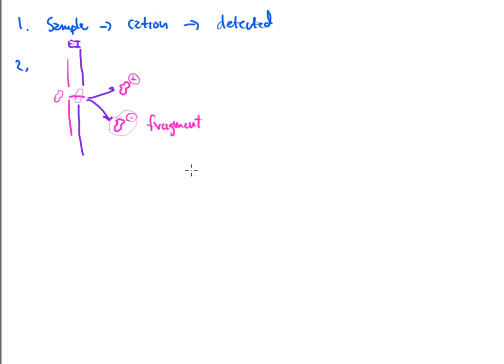And what we typically look for is something called a fragmentation pattern. They all will break up in a very specific way. They will give me different signals when it reaches the detector, and the detector looks at that fragmentation pattern and matches it to what it knows in its database. There are things that we can take away from the fragmentation pattern, and we'll begin to look at those. But this is why we're going to see more than one signal on the readout.